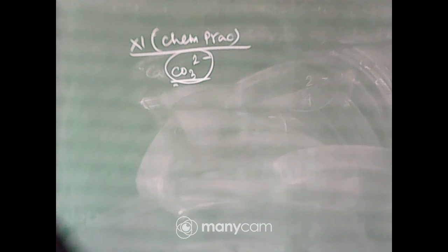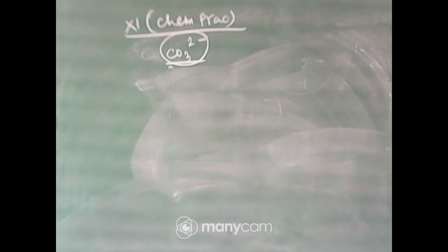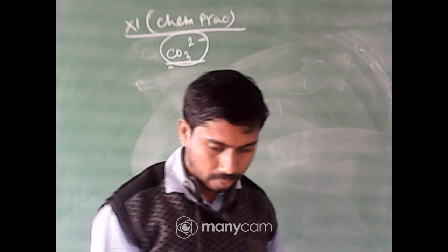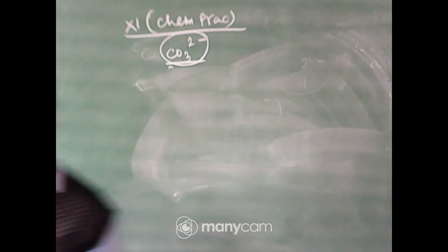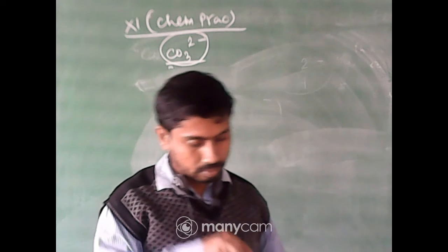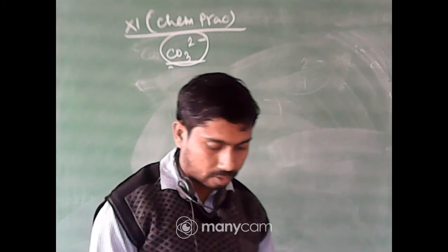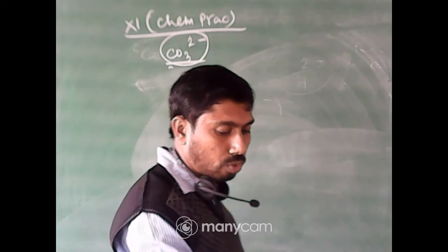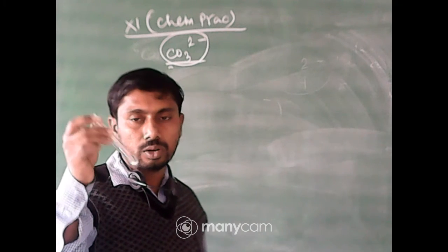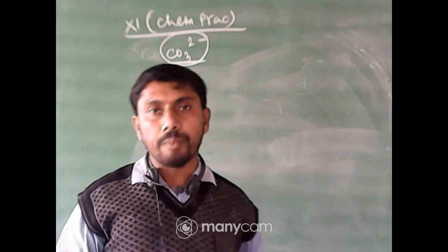Taking the solid sample, you have to know the texture, that is, it is a crystalline solid. If it is in dust form, then you will write in the nature that it is amorphous.